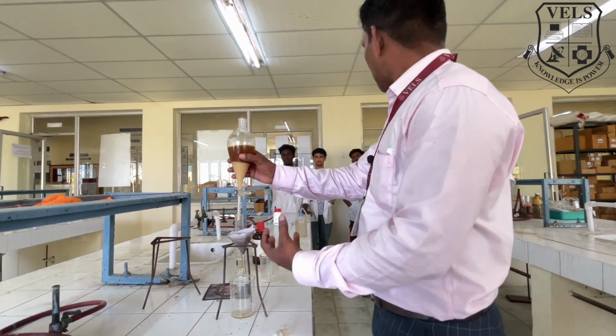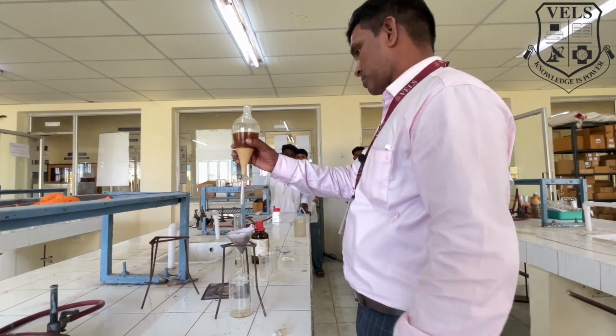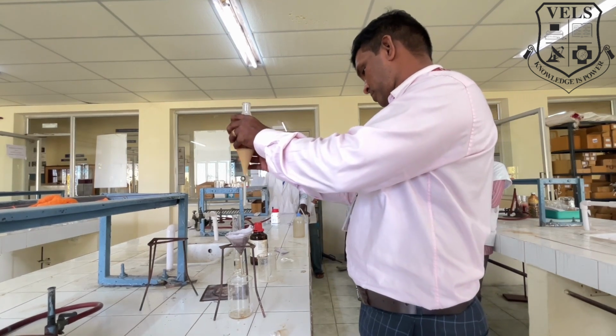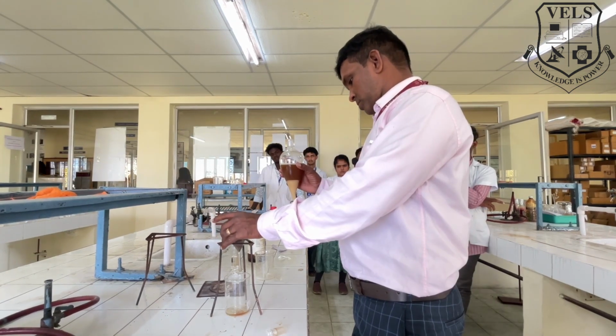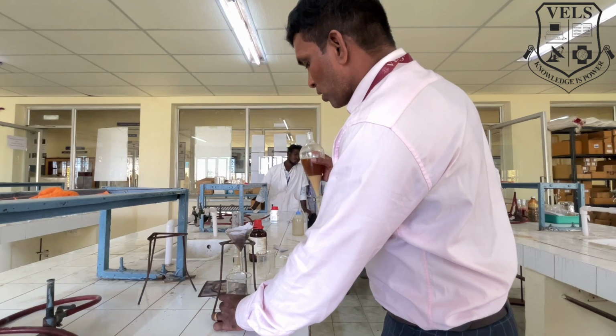Collect the pure chloroform. We are collecting the chloroform layer.